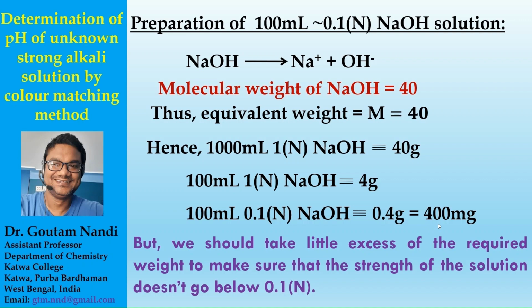So if we take 400 milligram, maybe that amount is not present there. So what we will do, we will take a little bit of excess of 400 milligram, maybe 450 milligram. Okay, then we will standardize this solution using the prepared oxalic acid solution.